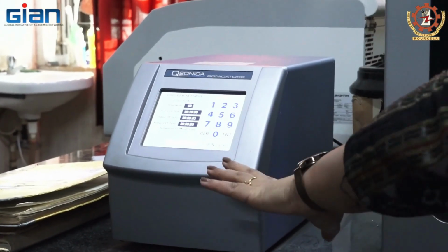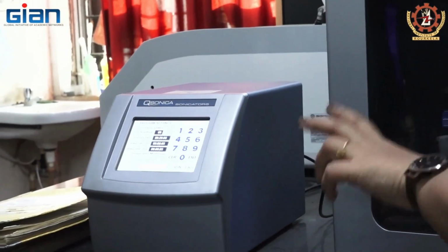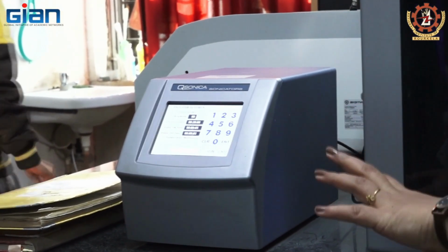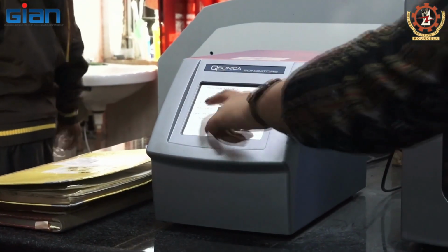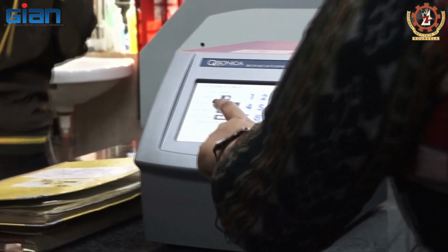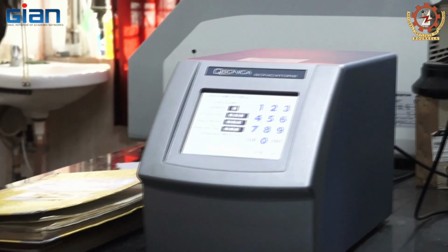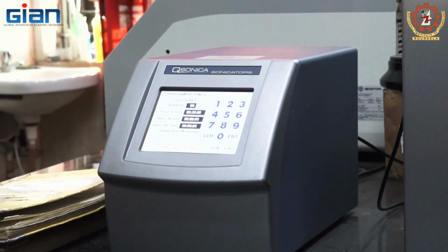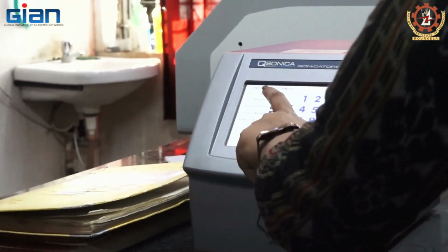This is the amplitude based generator. Sometimes you can see power based or frequency based generators also. Here the frequency and the power are constant, and the amplitude you can vary. Okay. In amplitude, if it is taken as 60%, the amplitude unit is 60%, and you can also convert the amplitude to the power. Okay, that is the 60.